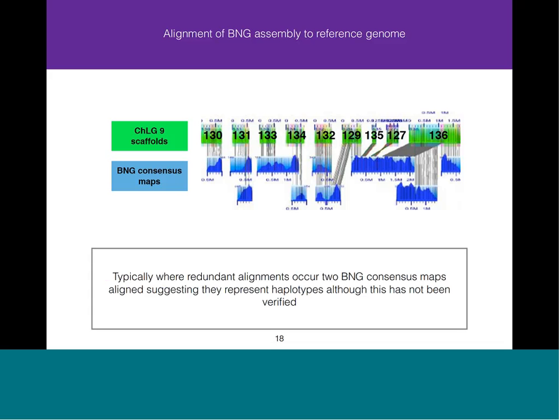So this is data from Tribolium for chromosome linkage group 9 here. And whenever you see these numbers on a scaffold, I've ordered all of our chromosome linkage groups from X to 10 and ordered the scaffolds within those from the first scaffold to the last scaffold. So numbers that are incrementing up around each other, like 131, 133, 134, are typically going to be from the same chromosome linkage group.